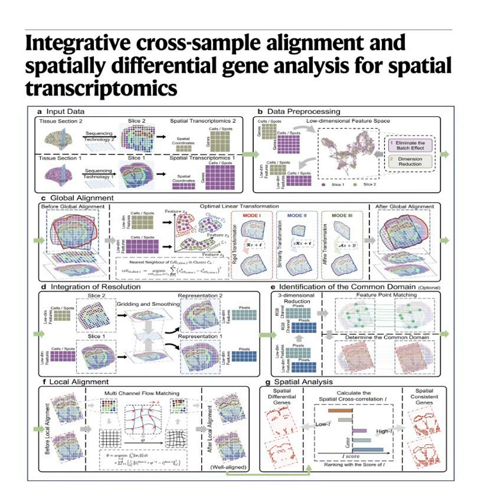So let's do a quick recap of this first major concept for you, the listener. CODA is a highly controlled three-step dance. Right. First, global alignment to rotate and fix the directional stretching. Second, it turns the data into a color image so a visual AI can crop out the matching common domain. And third, it uses a smart, stretchy rubber sheet to fix micro tears, but only if it passes a strict quality control gate to prevent fake data.